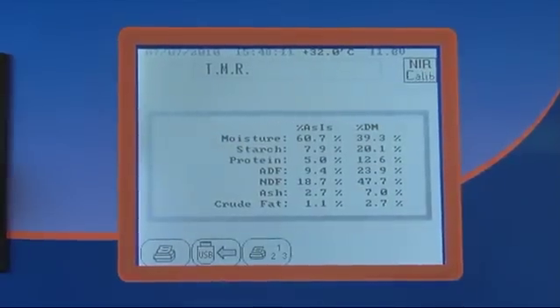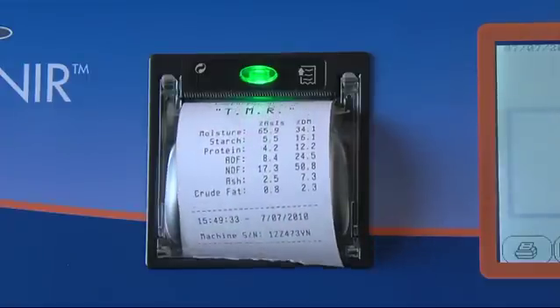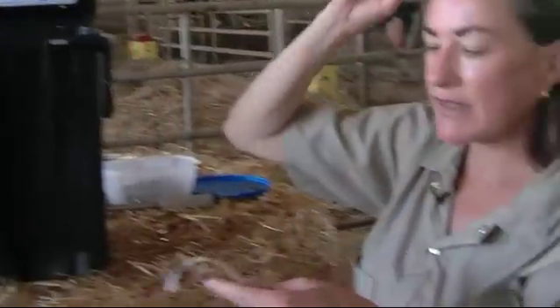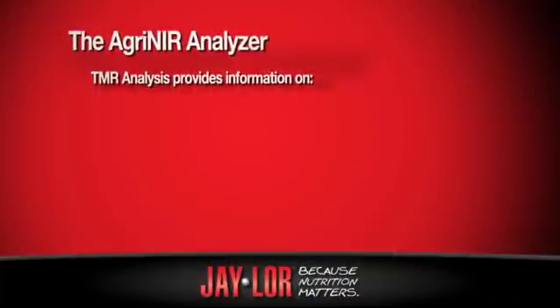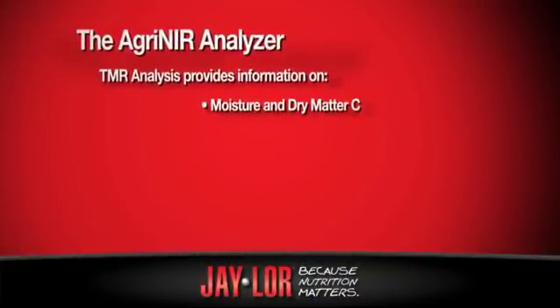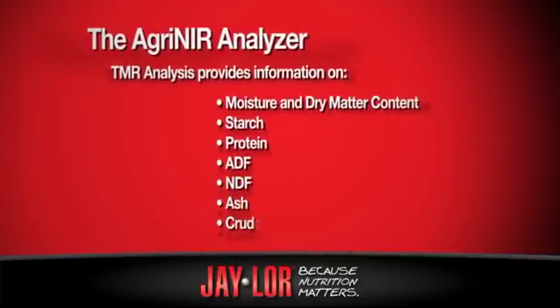I can print it off. And this is what I would give my producer, or what my producer would actually take for themselves. On this piece of paper, I'm given the moisture content and dry matter of the TMR, the starch, protein, ADF, NDF, ash, and crude fat.